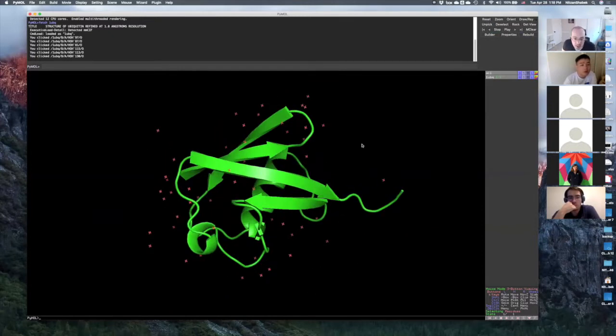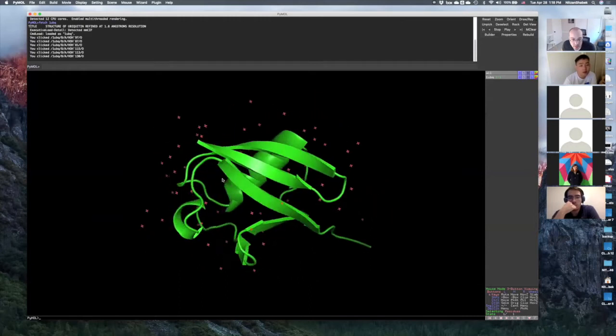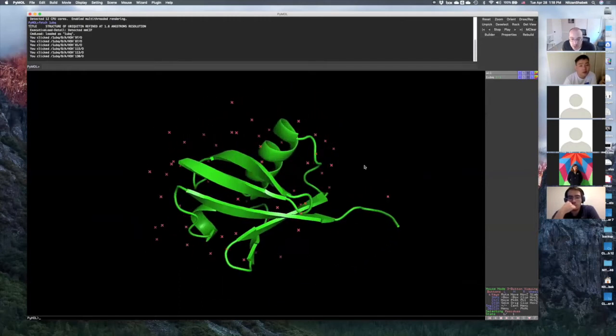So for now, does anyone have any questions about what is happening here? Did anyone have problems doing these maneuvers?